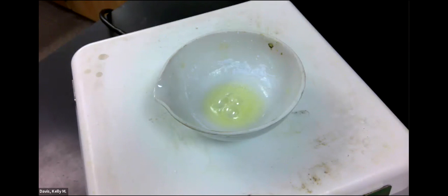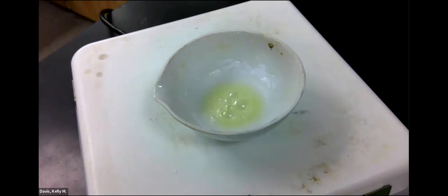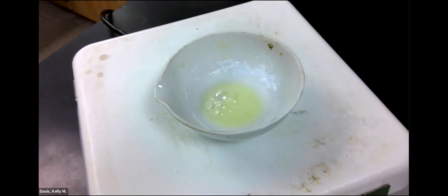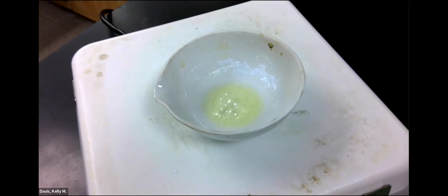All right, it's been about 5-7 minutes. We are still evaporating. It's still boiling. The liquid is starting to look a little bit yellow, but the solid is definitely white. You can see it start to form around the edges where it's getting dry. And I don't want to heat it too hot. I'm worried it'll crack. So we're just gonna keep going.